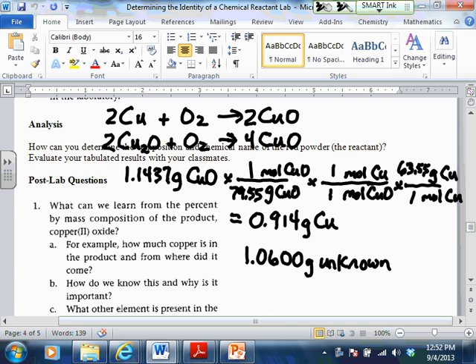So, and this data actually works out okay. I don't know if it's going to work out perfectly when we try to figure out our ratio, but this kind of shows us that maybe this is the more plausible scenario. You guys see that? Okay, and again, that's just sort of thinking about it conceptually, but this wasn't just copper to begin with. This red unidentified powder we had here was probably not just copper. Yes, ma'am?